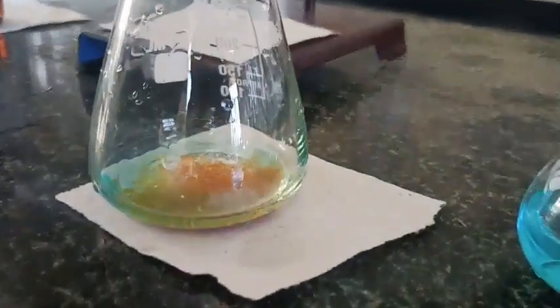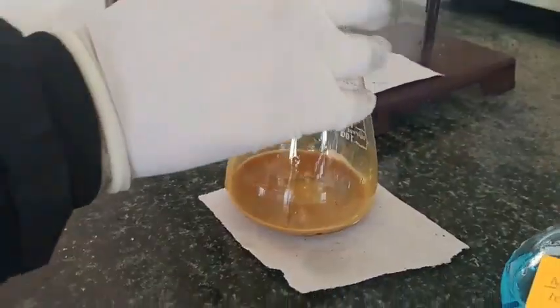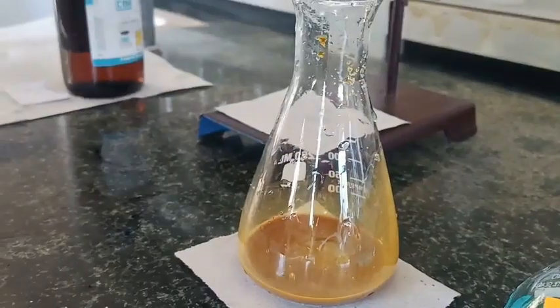You can see the change in color. So iodine is released immediately, but I leave it for 2-3 minutes after covering it with the help of a petri dish. Now I'm going to start the titration.